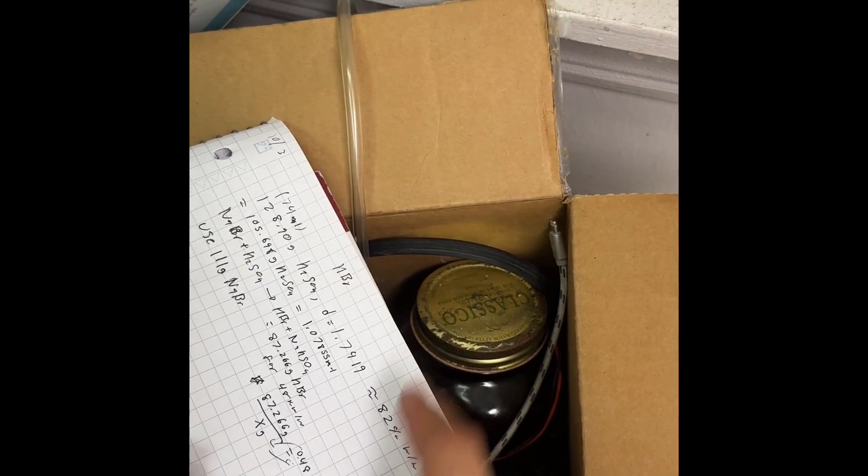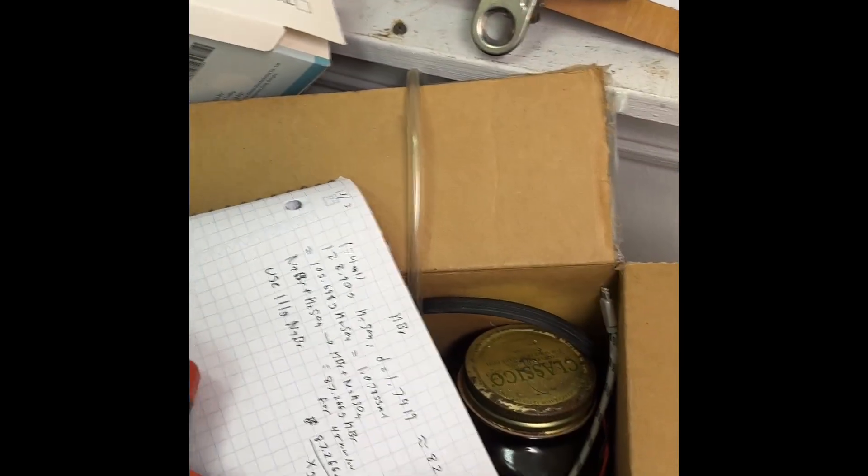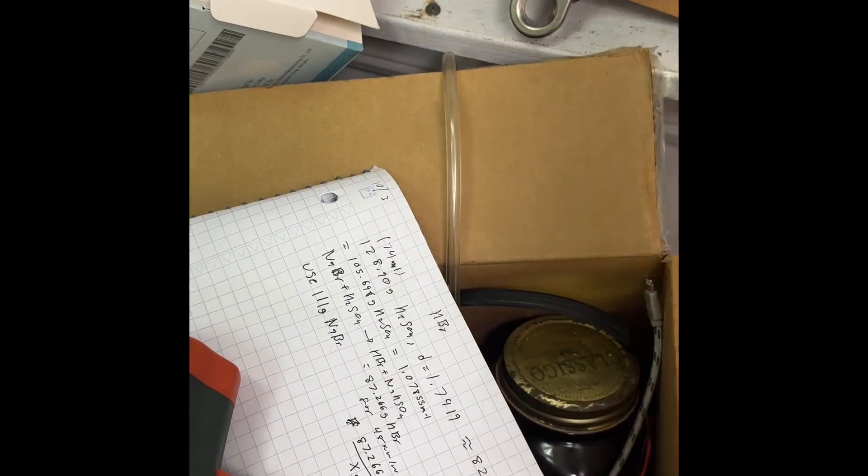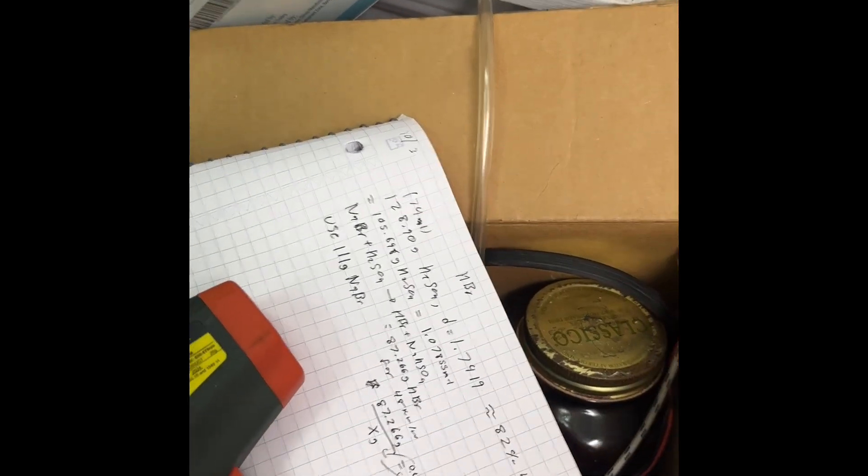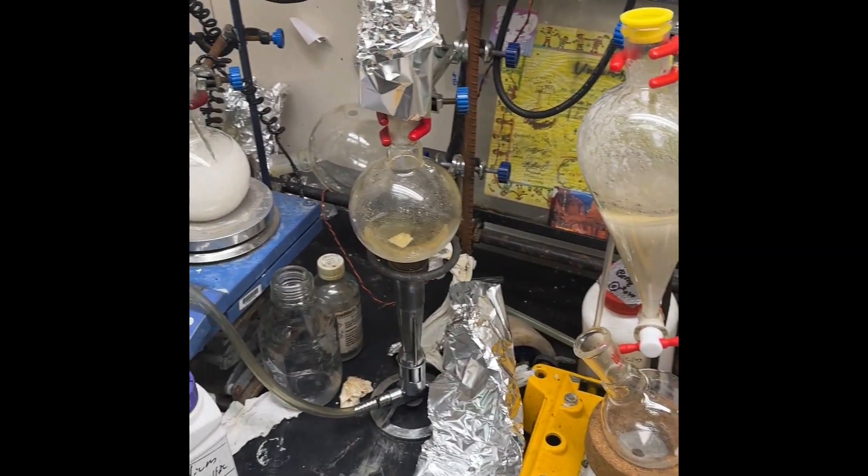Adjust for the amount of water in your acid. If you're using 98%, it's negligible. If you're using diluted acid like I am, because my drain cleaner is not always the same concentration, adjust for that. You can omit the water of hydration for the sodium bisulfate because it's going to dehydrate at the temperatures we're distilling it.